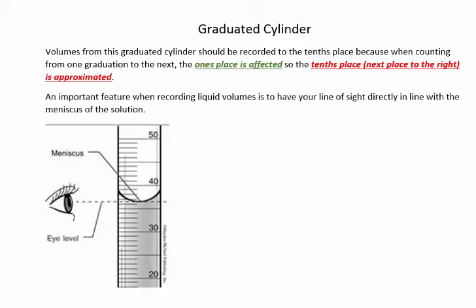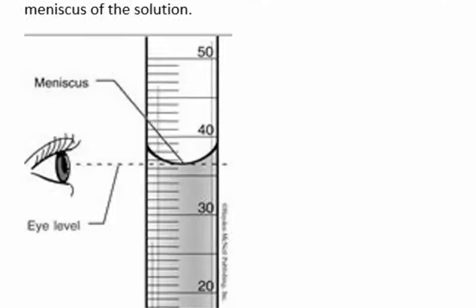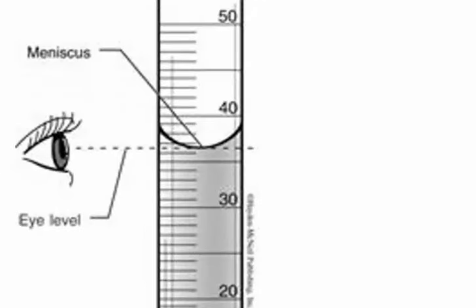Next, I'll show you examples with a graduated cylinder. Volumes from this graduated cylinder should be recorded to the tenths place, because when counting from one graduation to the next, the ones place is affected. So the tenths, the next place to the right, is approximated.